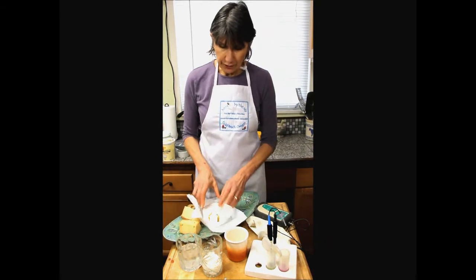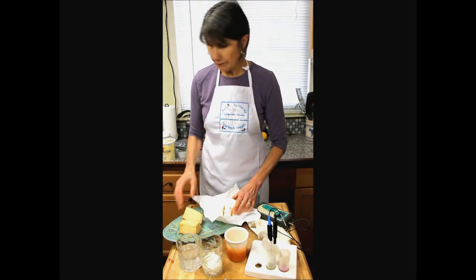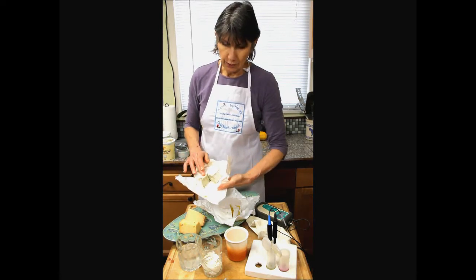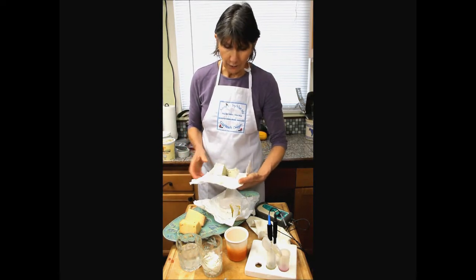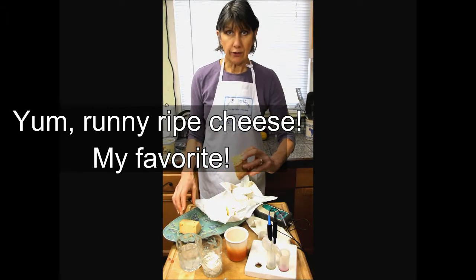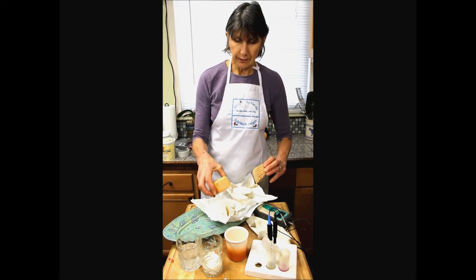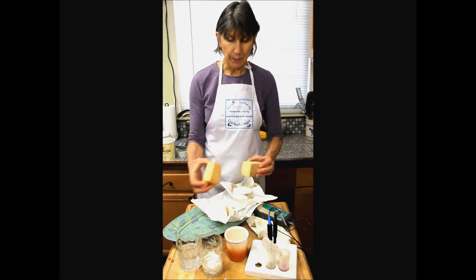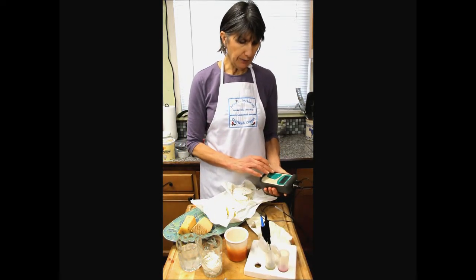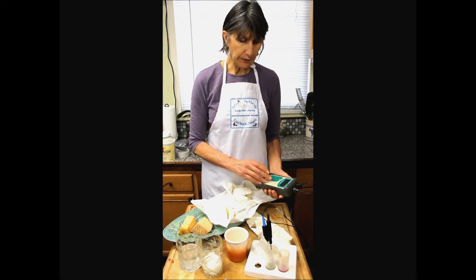So the cheeses we're going to check today are a bloomy rind camembert that's very young and not ripe enough yet, and then a truffle flavored camembert type that's overripe. And 2 hard cheeses, a naturally rinded one and a clear coated one that is only aged about a couple months. So the meter's off just a little bit, so I'm going to calibrate. Calibrating in the 7 first.